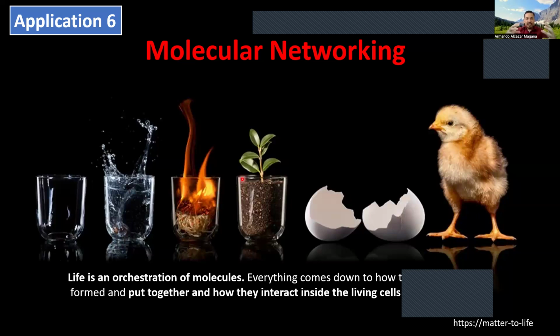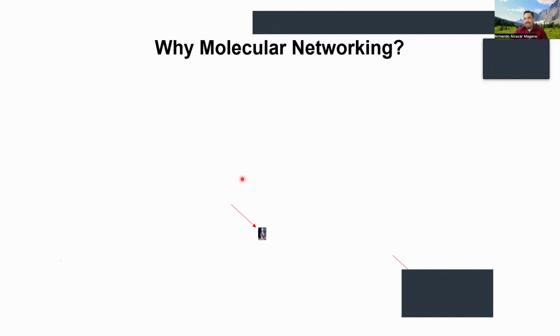And this communication, or this regulation of these molecules, is what makes a thing alive, right? It is the reason we can feel and think. And usually what we get with the mass spec instrument is basically dead ions, right? Elemental composition and not this interaction. So that is the reason we are very interested in doing molecular networking.